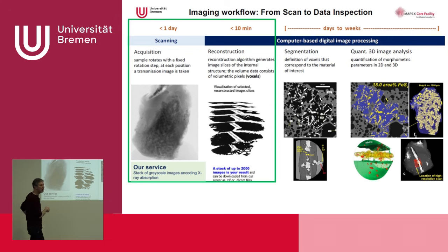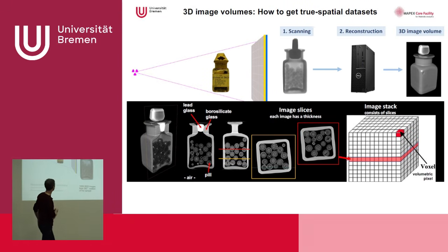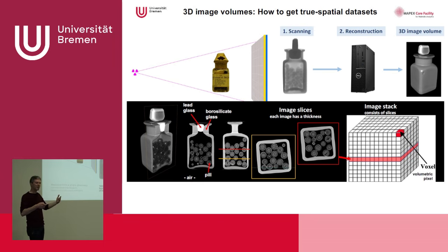And scanning is normally done in a day or in some hours. Reconstruction, nowadays it's about 10 minutes or even less. And the work with this kind of information, with the digital image analysis, could be from days to weeks, depending on the depth you want to go inside with your data. So let's see if we get this kind of image volume data set.